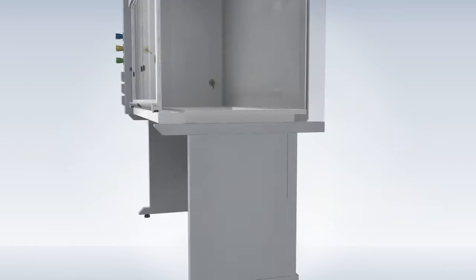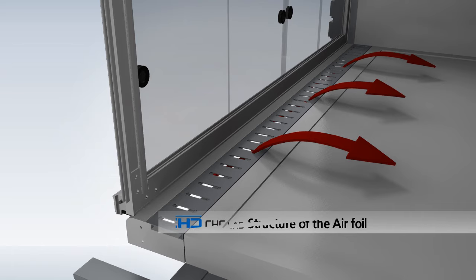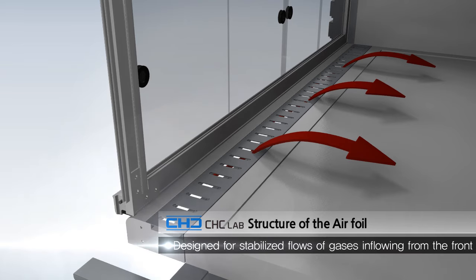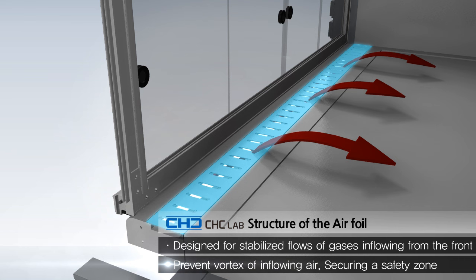A proprietary airfoil of the CHC Lab fume hood is designed to create a stabilized flow of gas inflowing from the front, and it prevents the vortex of air creating a safety zone.